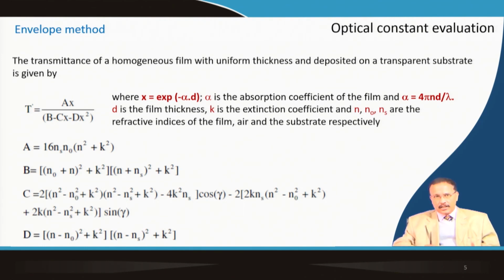Otherwise, just looking at these equations, it may not be apparent how things are actually being calculated. So, it is required for you to do it yourself, so that you can have a feel, and this process is quite generic in nature. It is applicable for any transparent film, and it is a powerful tool, and I will show you at the end that people have taken advantage of this, and they have come up with commercial equipment where all these equations are already fed, and you just press a button and you get the data estimated or calculated for you in a very convenient way.